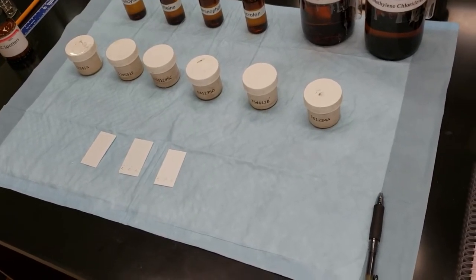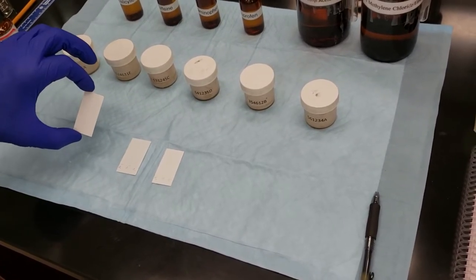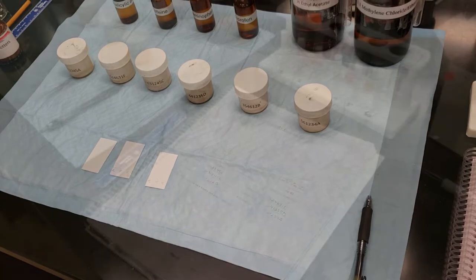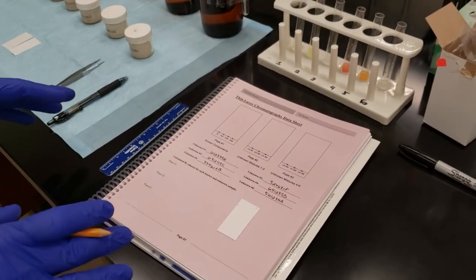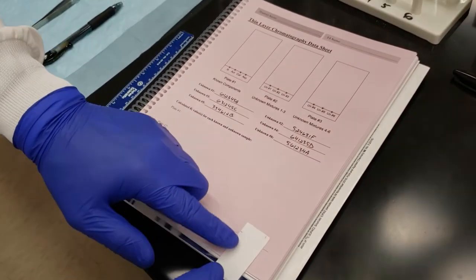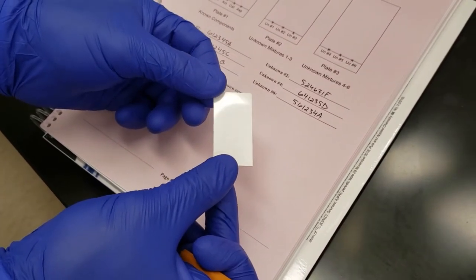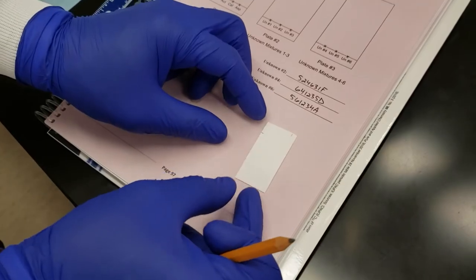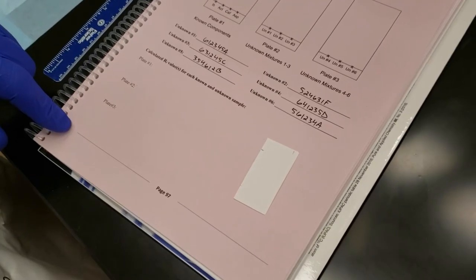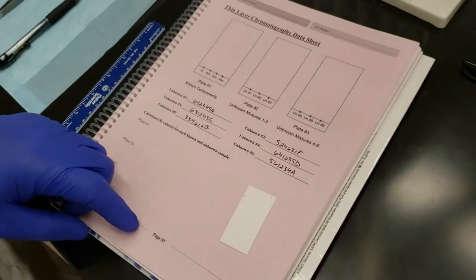So the next thing we're going to do is start putting together our TLC plate. Once we've done that, we'll go through our spotting technique. Before we can spot any of our plates, we have to construct our plate. We've got our TLC plate. This is a plastic plate, a smooth plastic plate. And on the front, it has silica gel embedded, and that's going to be our stationary phase. What we're going to do is spot our different solutions on top of that silica gel.